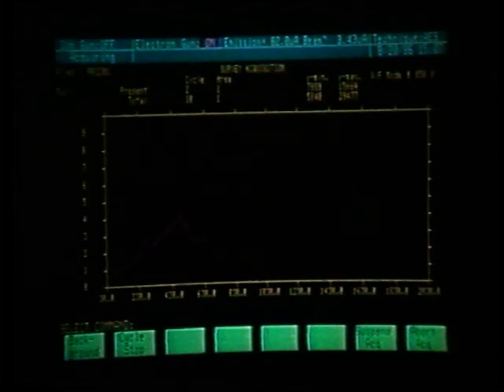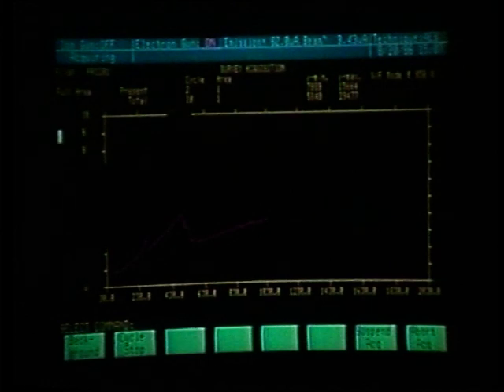Notice our file name is PRO201. We are now looking at cycle 2 of 10 cycles. We are doing a full area analysis, this being the one and only area. So we are analyzing area 1 of 1.